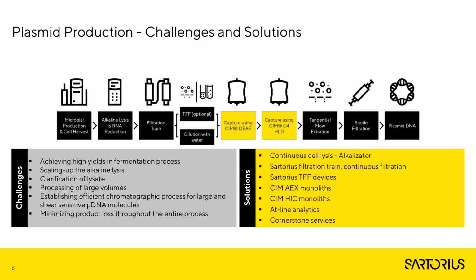First is the challenges themselves in fermentation, how to get to high yield. I'm not going to address this. We have other excellent teams working on this, but already at the point of lysing DNA out of cells, you can face significant challenges, particularly in scale-up. Clarification can be a challenge.